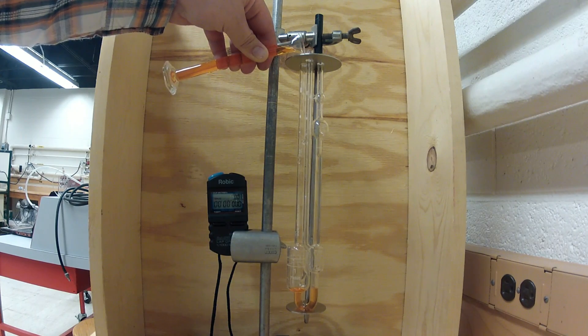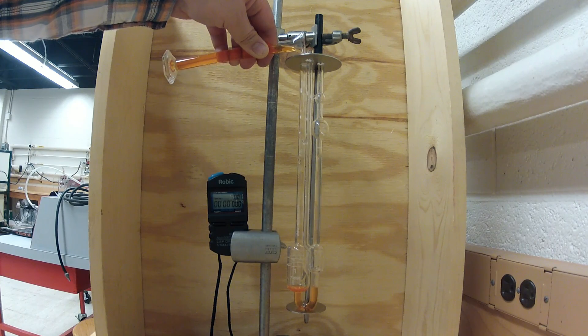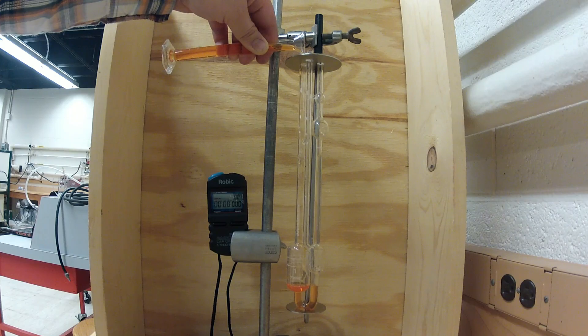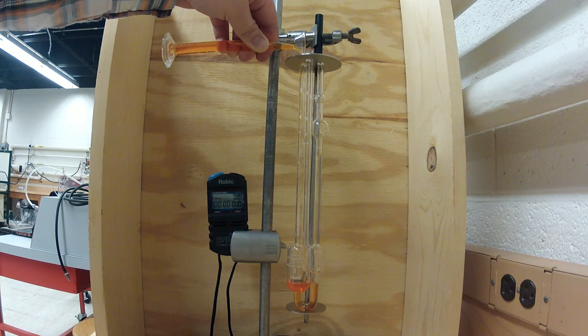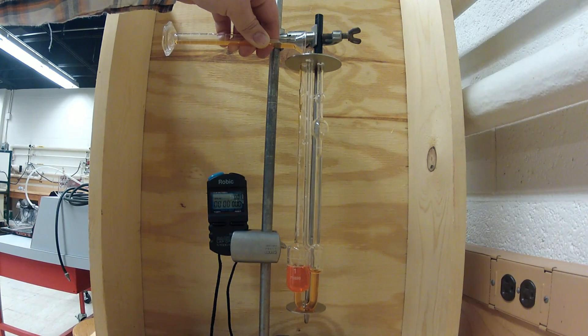When pouring the fluid, keep in mind you should keep a slow, steady pace to avoid spilling the fluid outside of the viscometer or upsetting any vacuum within the viscometer. You will want to pour the fluid into the viscometer until the fluid level is between the two markings on the lower reservoir.